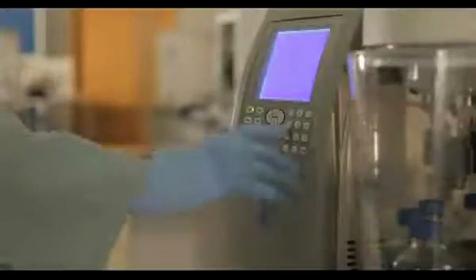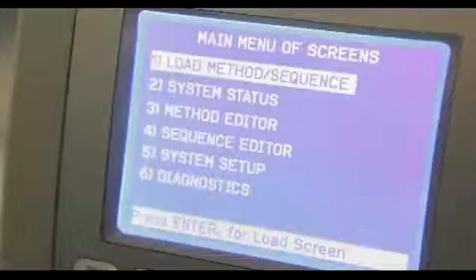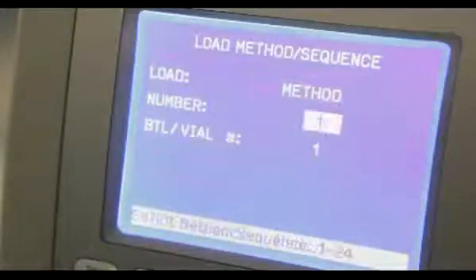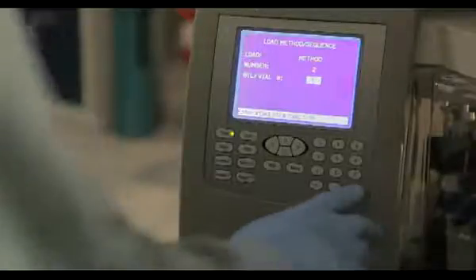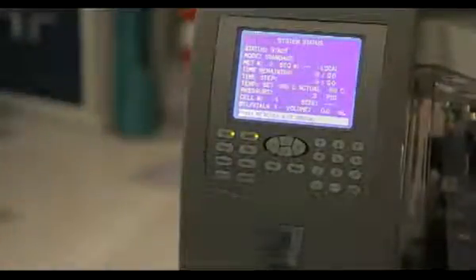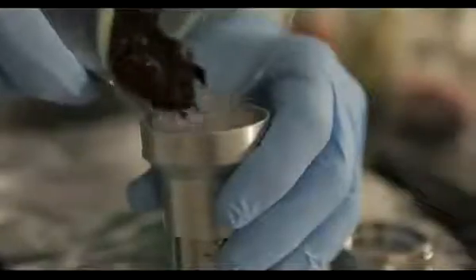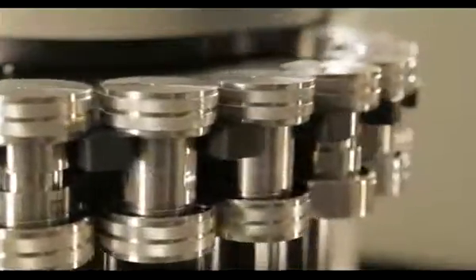The ASE system allows the user to easily vary extraction conditions, and its pH-hardened pathway supports expanded choices for both pre-treated matrices and post-treatment adsorbents for in-cell cleanup. These features support a vast range of applications, making it the most versatile extractor on the market.